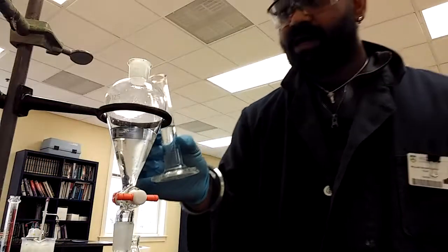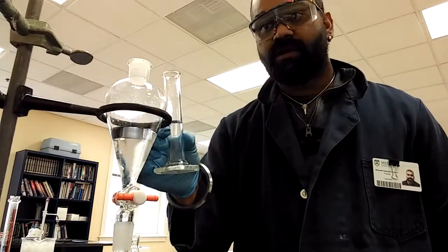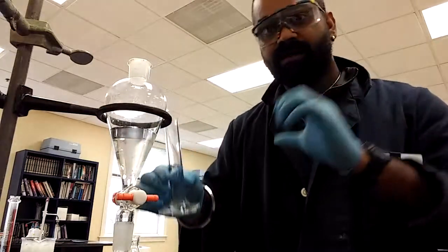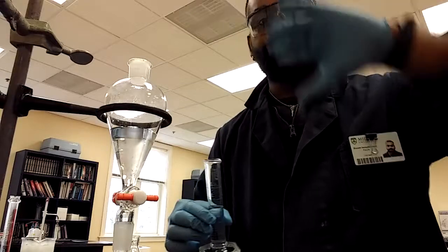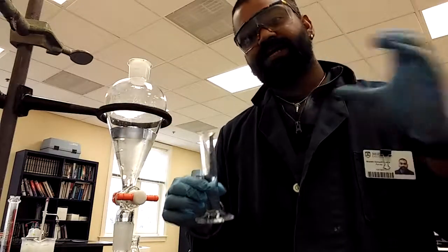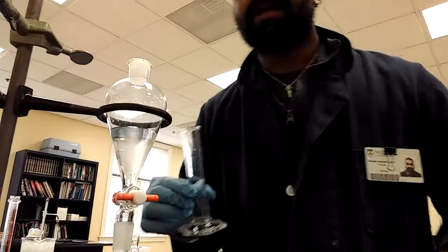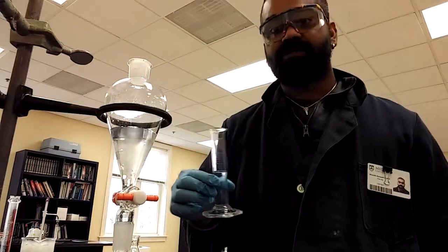And here I got my 12 milliliters of t-butyl alcohol. You don't want to add all of this in one go, okay? Add a little bit, shake, flip the stopper upside down, vent, shake until you use all of it. And then after that, we're going to shake it a little bit vigorously, cap, release the air each time, and then we're going to let it stand for about 5 minutes until the two layers separate.